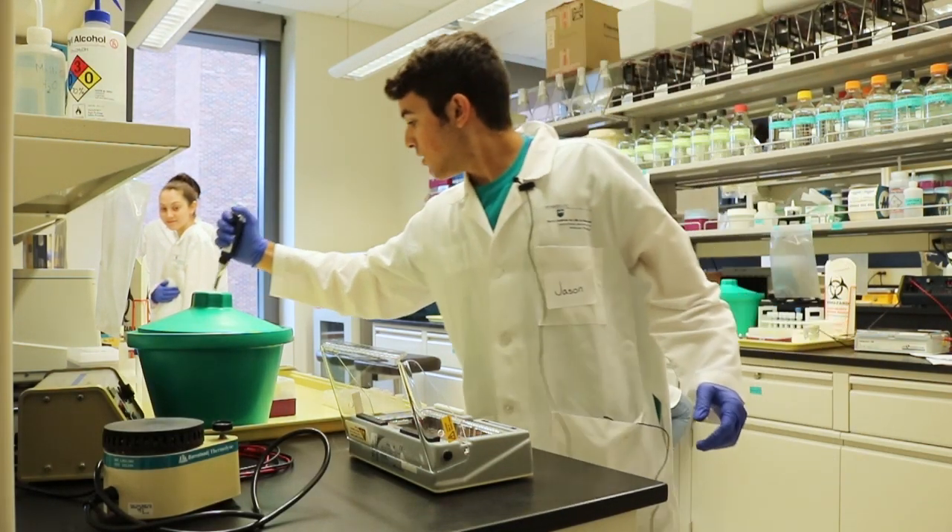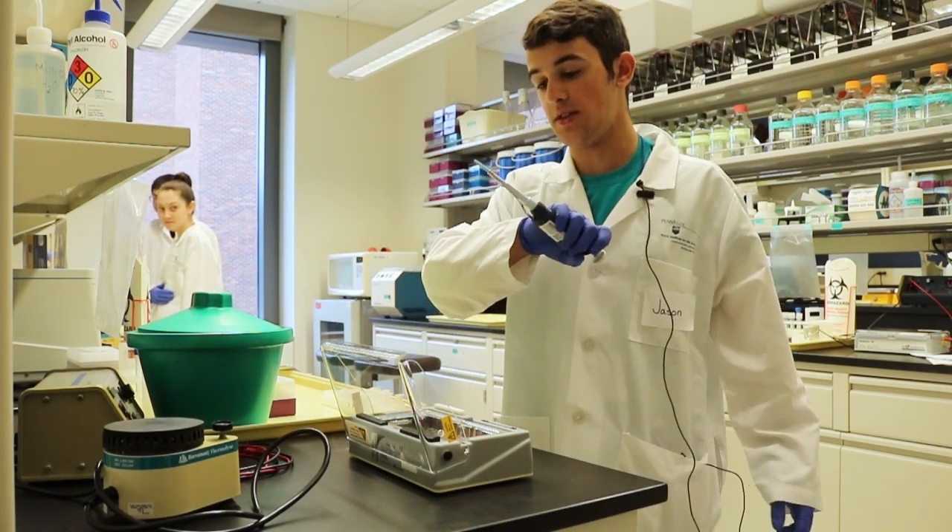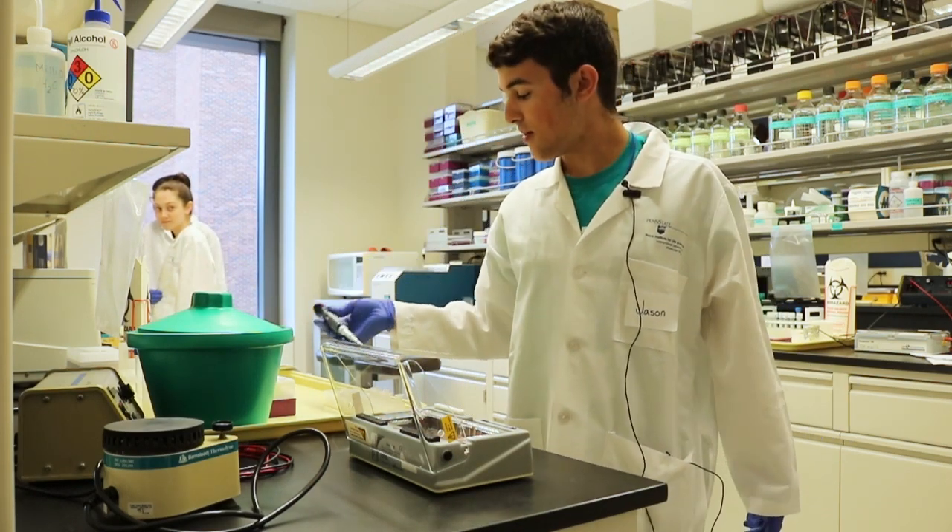Once you're done, you click this button right here and it takes off the tip. And that's it — that's how you pipette.